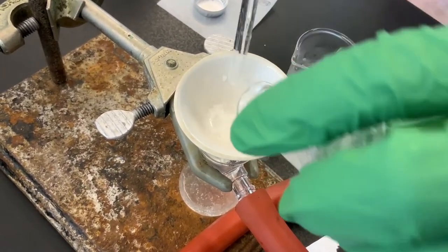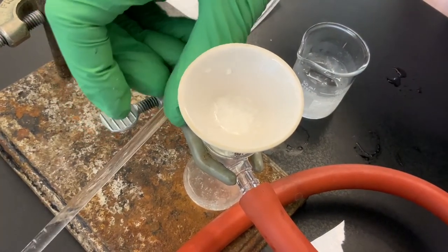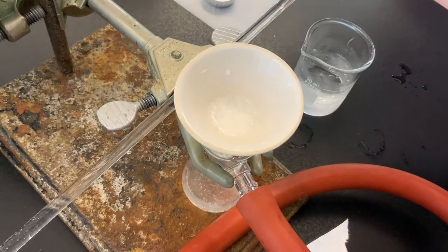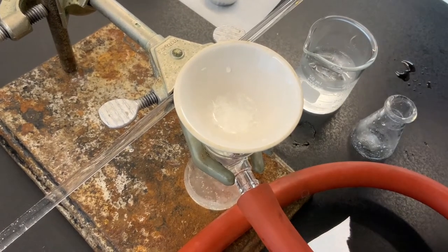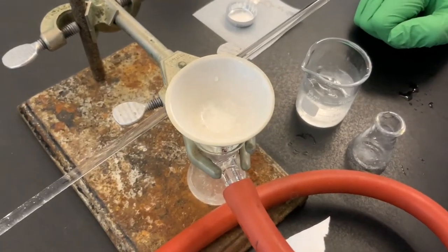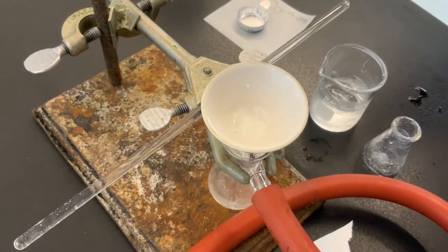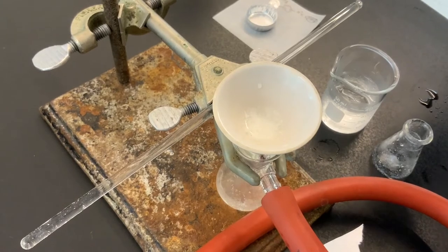All right, so this has helped me effect a quantitative transfer, or attempt one anyhow, and also I've rinsed the solid of any residual base. Okay, so now what we're going to do is allow the air to pass over this for some time and continue on with our experiment. And so that's just to dry the benzocaine. So we're going to leave the vacuum on and have the air pass through it.